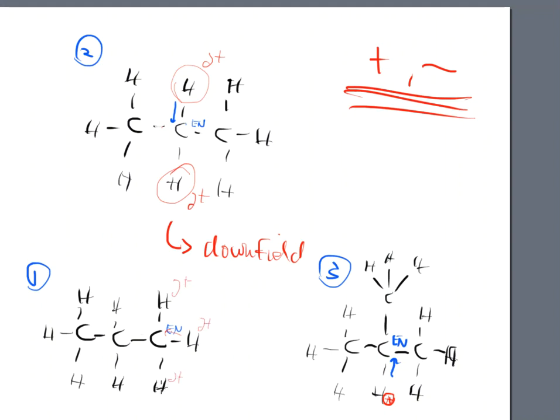And the reason it's very faint is because carbon now has a kind of triplet that it's going to have to figure out how to fight against. So this is what gives rise to the different signals in NMR. It's still electronegativity based, but it's not bulkiness based. It's not how covered up the protons are. It's about the actual charges that are on the actual protons.